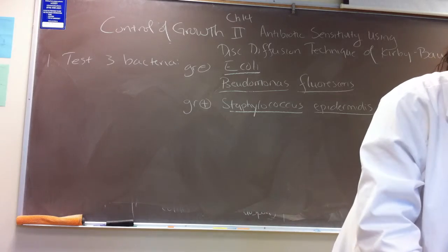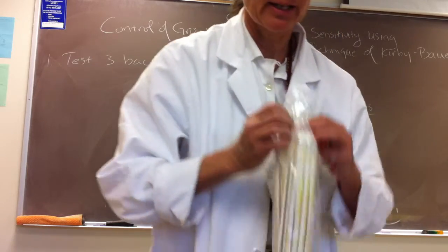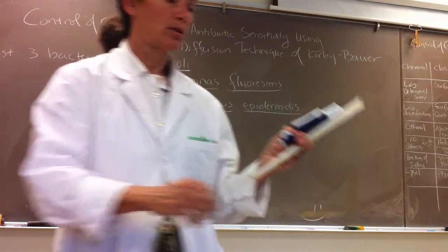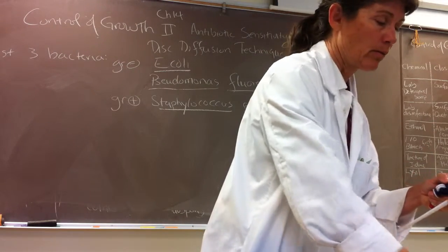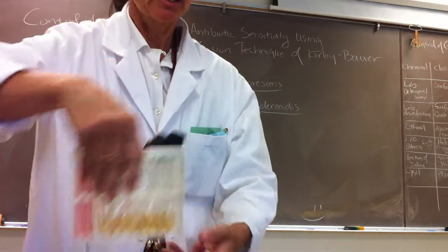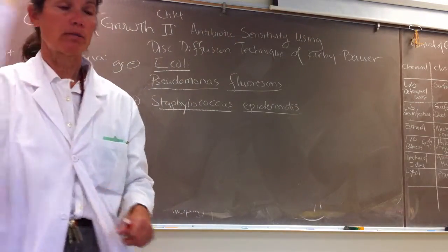So just as you did last week, for each of the bacteria, you'll get a new sterile serological pipette, and you'll use the pipette pumps to transfer 0.5 mL of the stock culture into 4.5 mL of fresh TS broth, just like you did last week, using aseptic technique. And then for each of the diluted cultures, you'll come up and get a fresh sterile cotton swab.